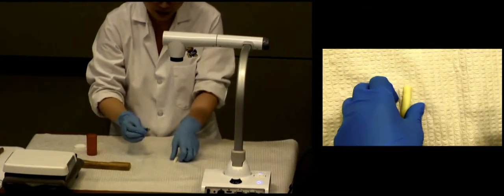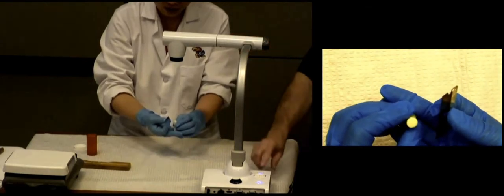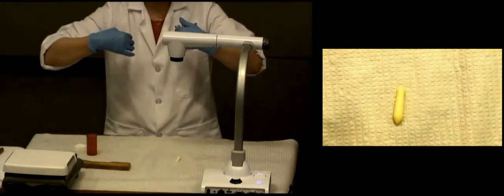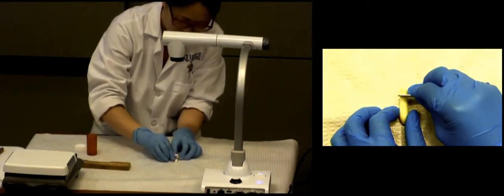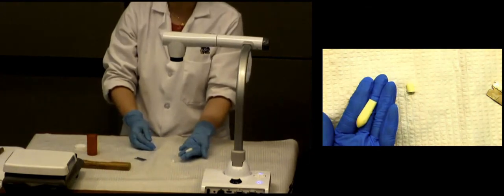We said at the beginning, this one doesn't show the hole on the very top there, but you're probably going to see that on your own product. As they solidify, they kind of retract and then form a little hole in the middle. So anyway, we're going to cut right here on the line. All right, and this is a piece of final product I can dispense for my patients.